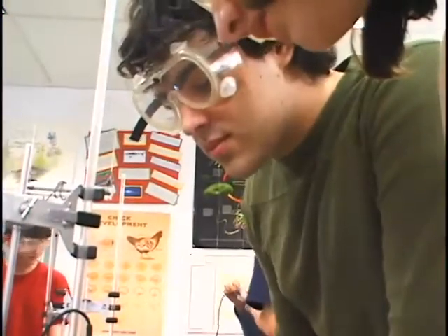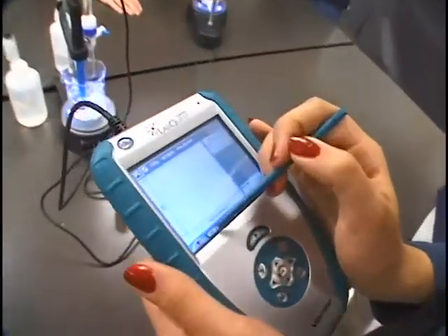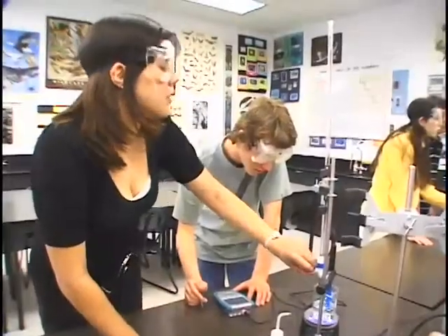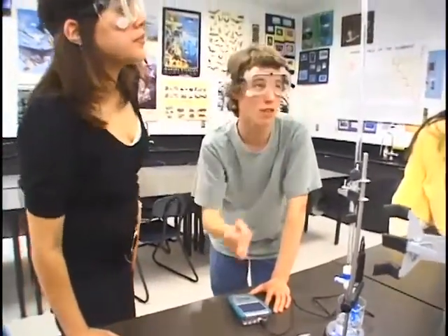My number one advantage for using probeware in a science classroom is that kids like using technology. They're very comfortable with computers. It makes the science class more fun for them and I think they work harder. And as I mentioned, the tedium is gone so they can really concentrate on what the experiment means.